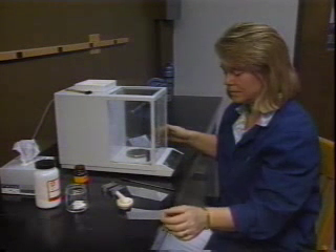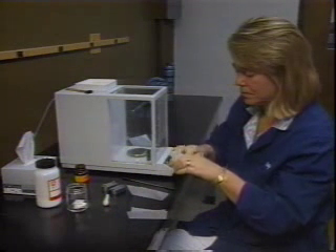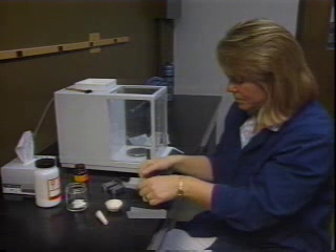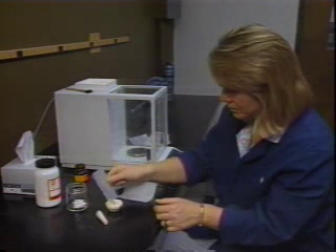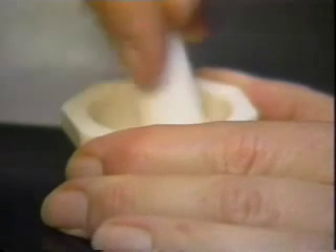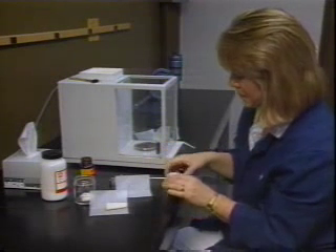It takes very little sample to run a KBr pellet, and it's important that you do not use too much. The weighed sample is combined in the mortar. The special mortar is made of very hard ceramic so that foreign particles will not contaminate the KBr pellet. Check to make sure that the mortar and pestle are clean, since students usually abandon them dirty. If it is dirty, wipe with a KimWipe — do not rinse with water. Grind the combined sample for several minutes until the mixture is a fine powder like flour. The sample must be finely ground to reduce scattering losses and absorption band distortions. When finished, transfer the sample back to a piece of weighing paper.